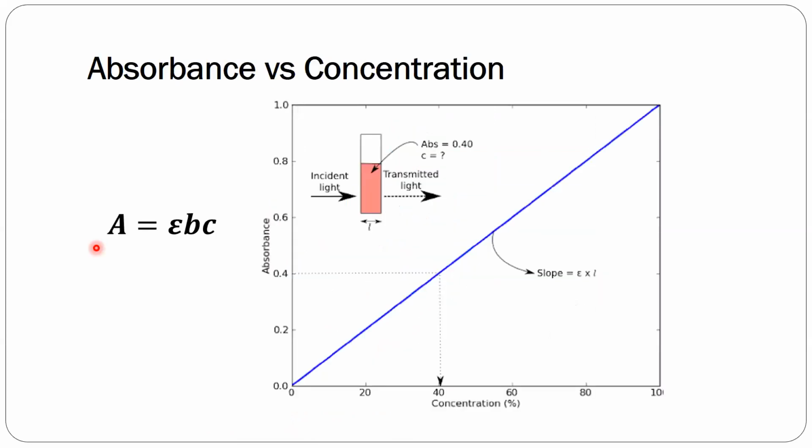Now, again, the point there is that the relationship between absorbance and concentration is linear. So here, if you're going to plot absorbance versus concentration, whatever that concentration is, percent, ppm, or molar concentrations, but usually your molar absorptivity epsilon is written with units of liter per mole centimeter. Okay? So that's why your concentration na kailangan gamitin ay molar concentration. But again, you can use ppm or other units of concentration. So the slope of this relationship will be, of course, epsilon times the path length. And if you have this as constant, so you'll have a constant slope.